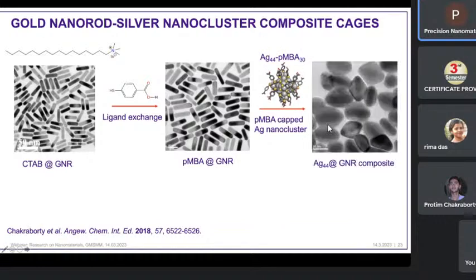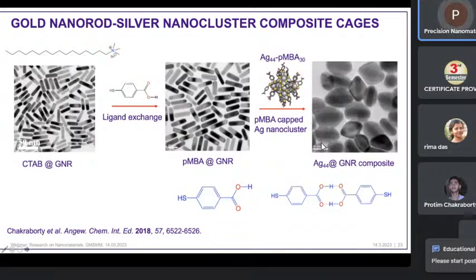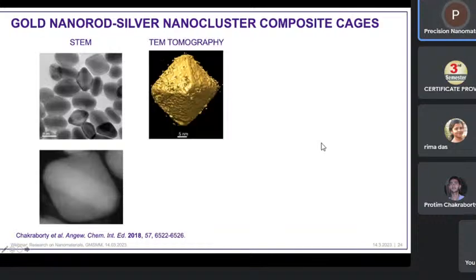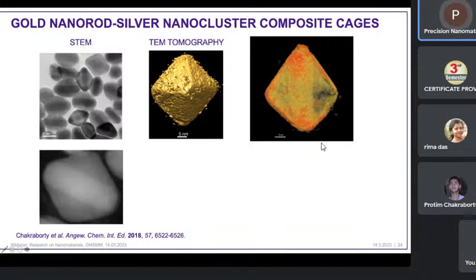And this is not that exciting, but what's interesting is that we have this type of structure, each of them encapsulated a single rod. And that is because the reaction between two types of particles is molecularly precise or atomically precise clusters which have the same type of ligands and the surface is the same. To understand how this is the structure, let me show these projections, quickly you can understand. And you can do the reconstruction image.